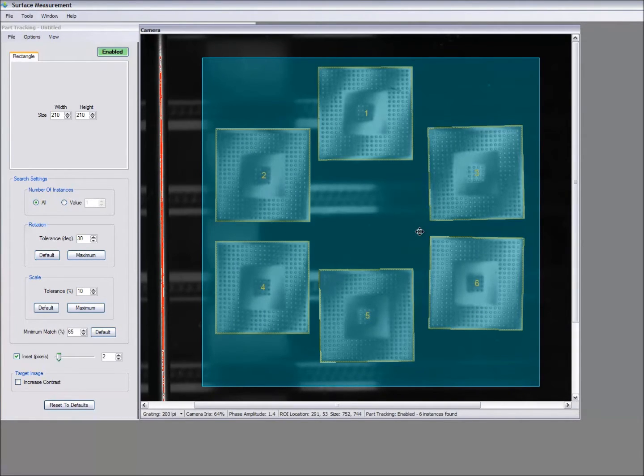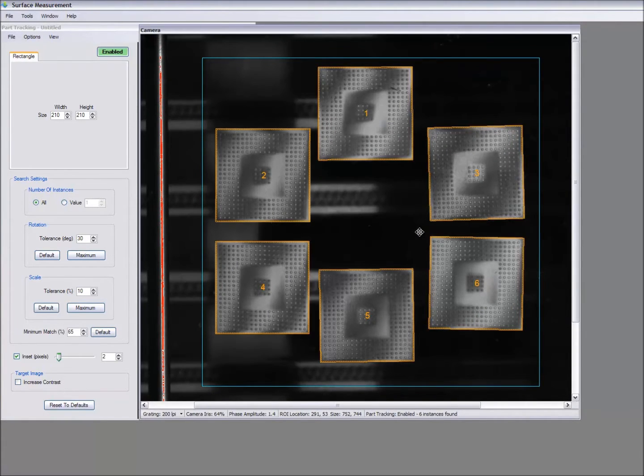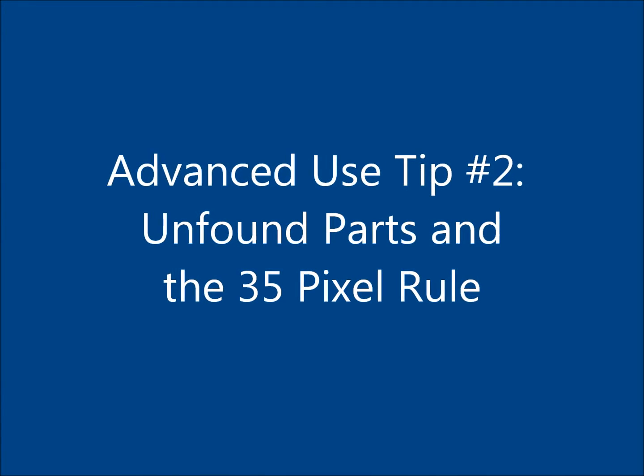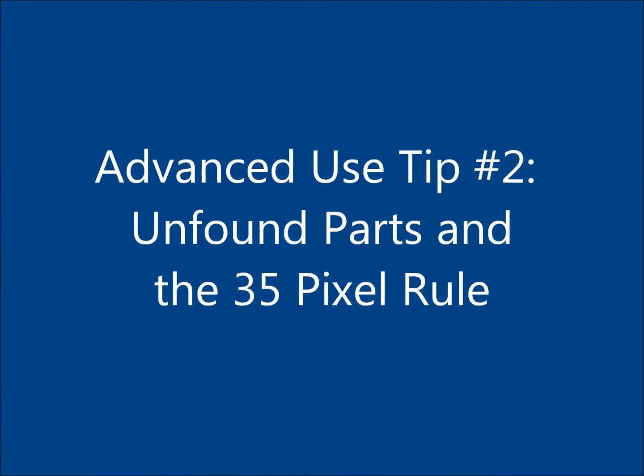If we move the 2 center parts again, we will see that the numbering is changed. The top center part is now part 1 because it is more than half the part size above samples 2 and 3. Similarly, the bottom middle part is within the 50% part size barrier and has been named back to part number 5. Remember again that once a profile begins, the part numbering will not change, which leads us to the next tip. Tip number 2 covers lost parts during thermal profiling and the 35 pixel rule.